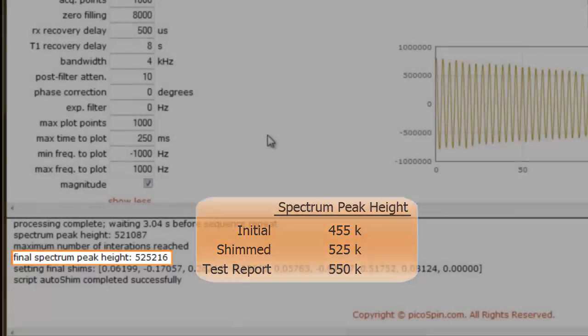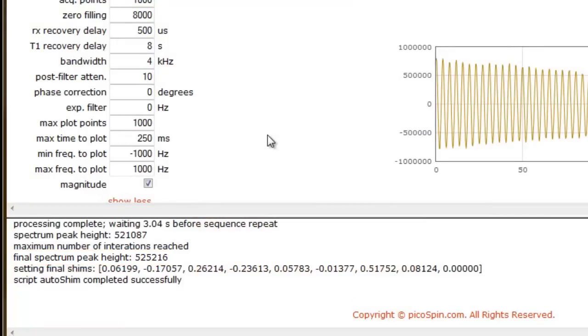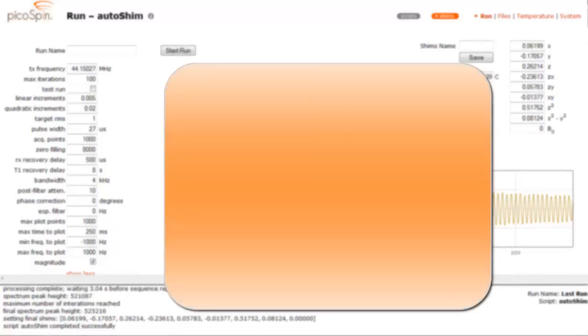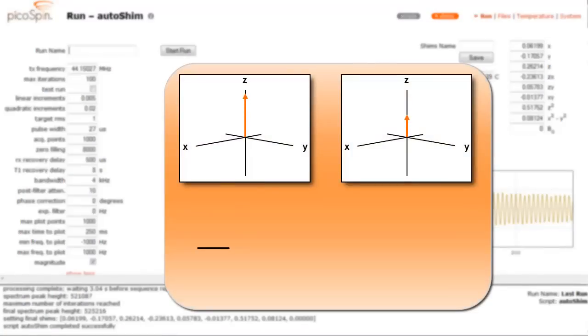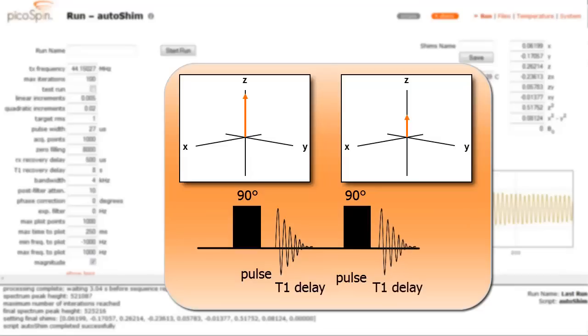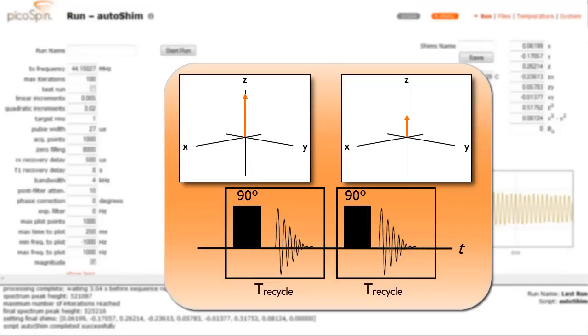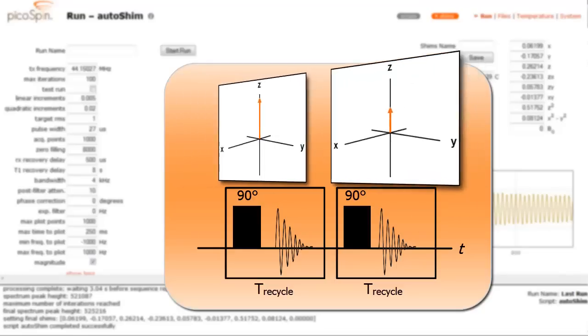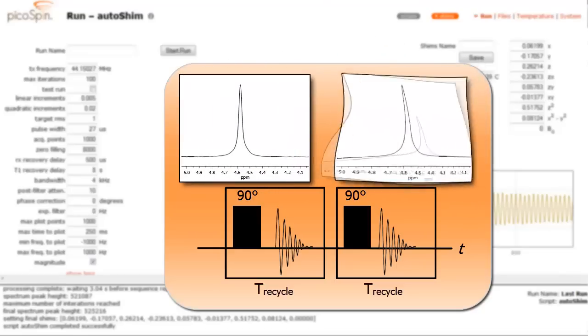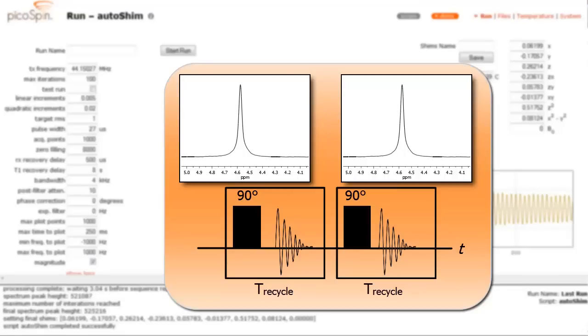So what's the difference? The lower signal intensity after shimming has to do with the fact that the proton signal is not a fully relaxed one. Remember, we're pulsing the RF coil every 8 seconds, but water protons do not fully relax back to their equilibrium magnetization within that time period. So long as the recycle time between pulses is fixed, we don't have to wait for the protons to fully relax when we shim. If we wait about 30 seconds after the AutoShim script ends, our water protons will have fully relaxed back to equilibrium, and if we execute a test run, the spectrum peak height we obtain will be comparable to the test report value.